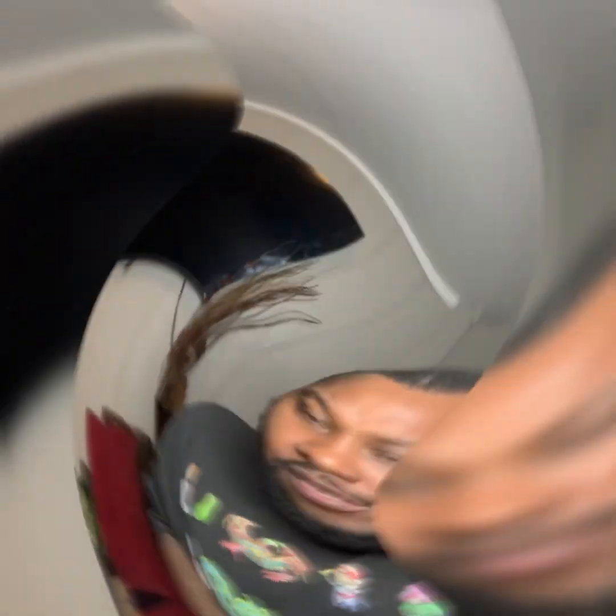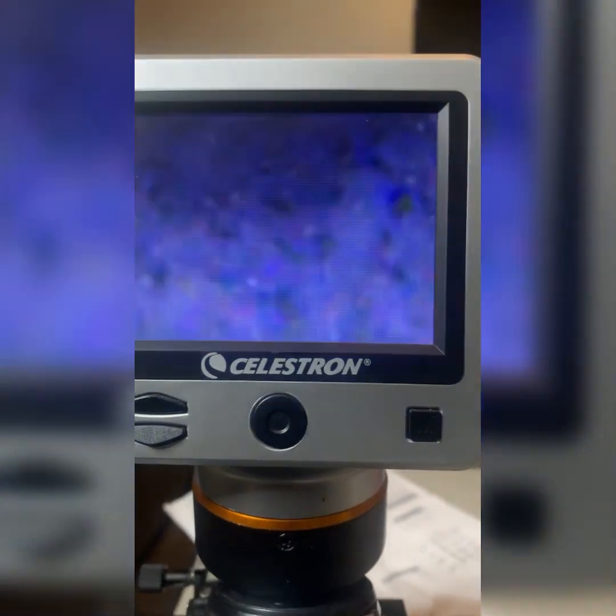Now what I'm gonna do is go in the house and load up my microscope so we can see the sperm active. Back in the house — I got my microscope slides, and I'm gonna load it up on the microscope so you can see the sperm moving.